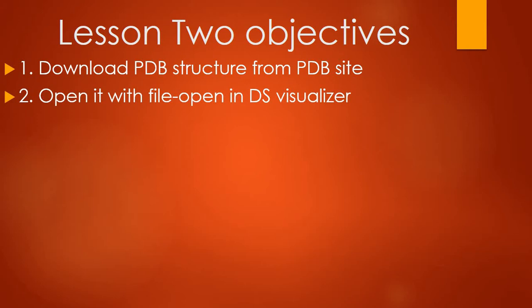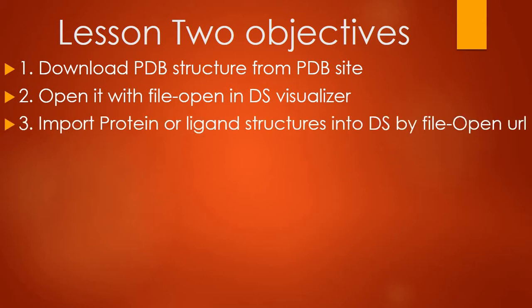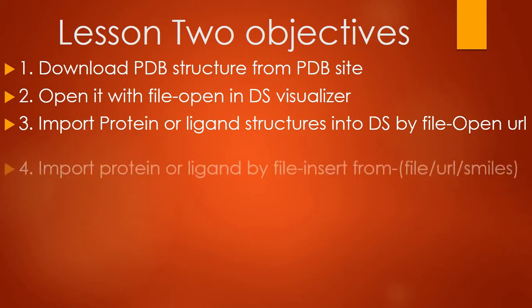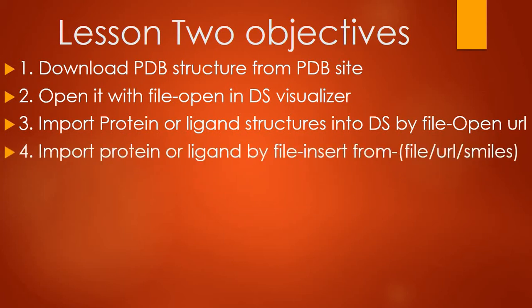Our second objective is to open the downloaded structure in DS Visualizer by going to File and then opening the structure. The third method is to import the protein structure, and we will also learn how to import ligand structures into DS Visualizer by going to the File menu and clicking on the Open URL button. Our fourth objective is importing the protein or ligand structure by going to File menu and clicking on the Insert From option.